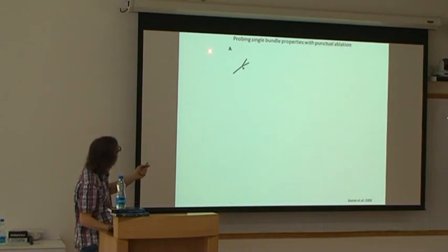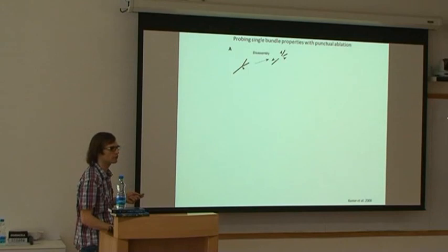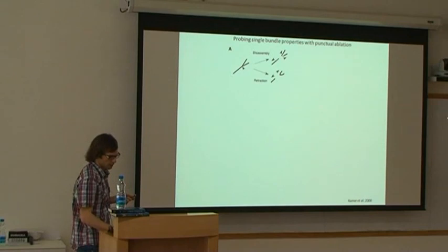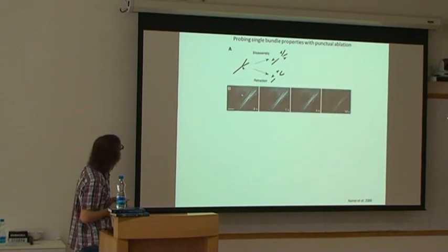He tries to say, okay, let's see if I can find a case like this, where I have a bifurcation. So if I manage to cut exactly there, in the intersection, well, if there's disassembly, then all three will start to disassemble, and I will start to see, in fact, the edges of each fiber. If there is no disassembly, two will stay connected, and one will detach. So this is what he shows here.